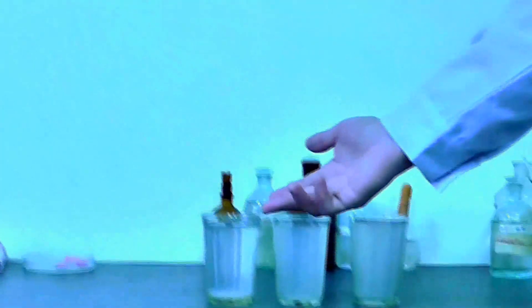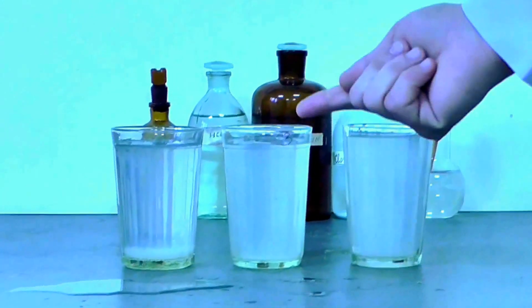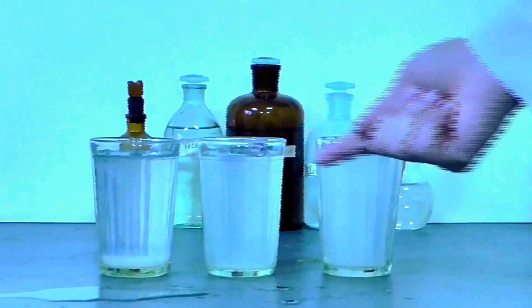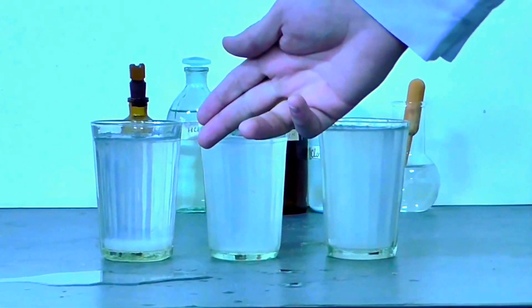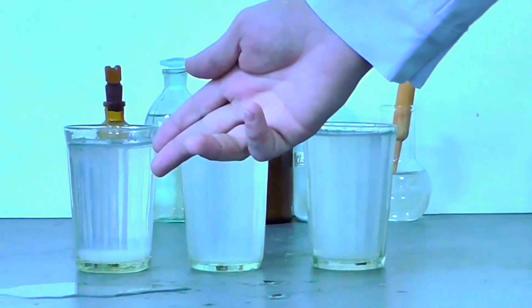Now as you can see in glass number 1 the coagulant has precipitated and the water has become clear, as opposed to the second and third glass that still have a high level of turbidity. Now we can conclude that 4 milliliters of coagulant is of optimal concentration in order to purify the water.